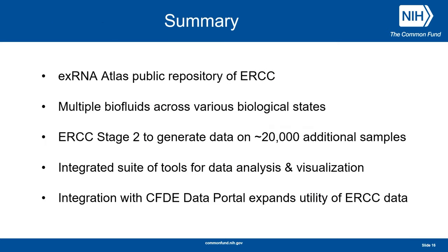So a quick summary: the Atlas is a public repository for the ERCC. The data there is from multiple biofluids across various biological states. It's been published, and we have another publication coming up. I think through the end of stage two, we will add another 20,000 samples, give or take. Even though the focus may be on RNA-seq and additional qPCR, there'll be a new data type. So I think that will enrich the data set, and also lead to the development of some additional tools. So it's a resource that not just contains the data, but has integrated tools. We encourage you to take a look and use that for your studies. And then looking beyond the ERCC, we see with the CFDE an opportunity to have the ERCC data become more usable in terms of integrating it with proteomic data and variant data and other types of data, and to enable a variety of different use cases.